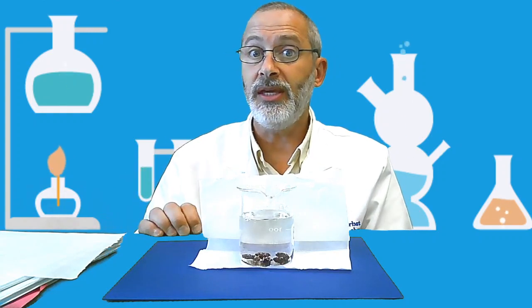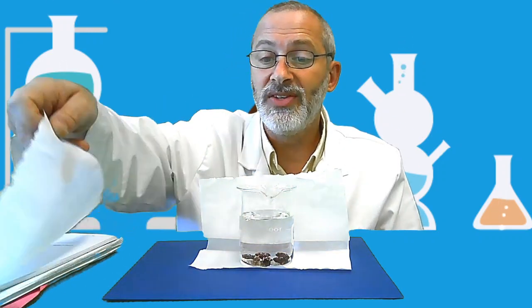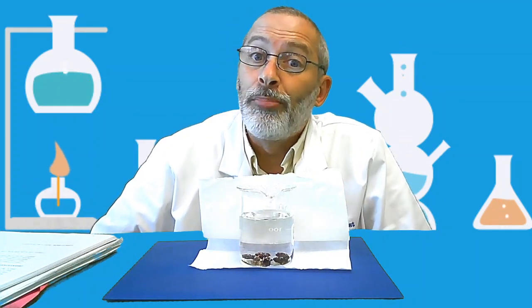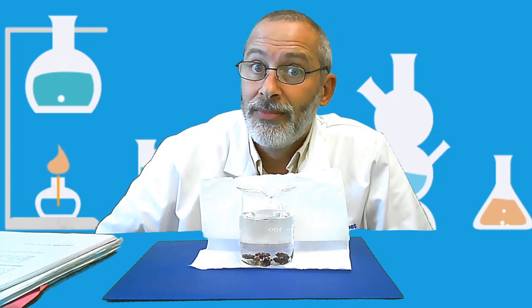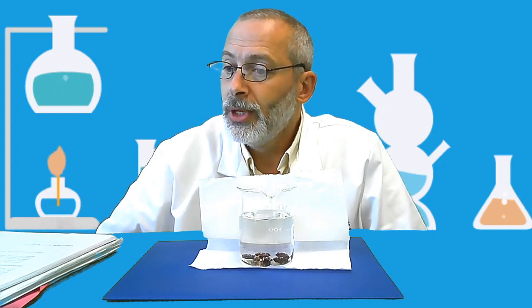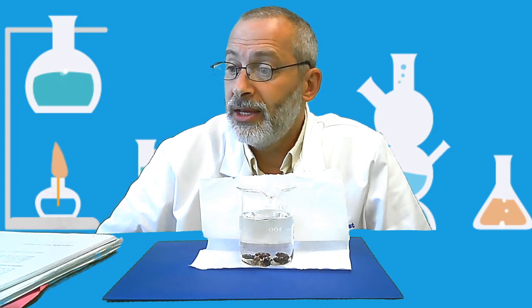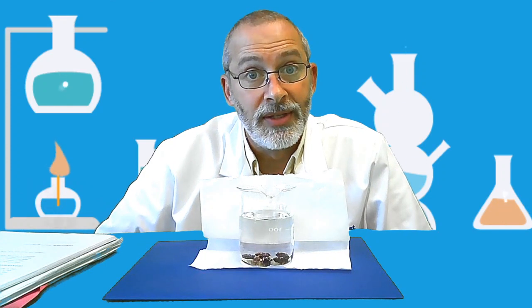Water is the key. We put them in water, and remember what the raisins represent. The raisins represent cells. And think about your question once again. Your question is, how do you expect to observe osmosis taking place with the dried raisins?